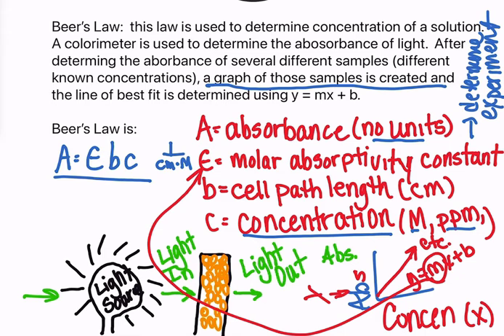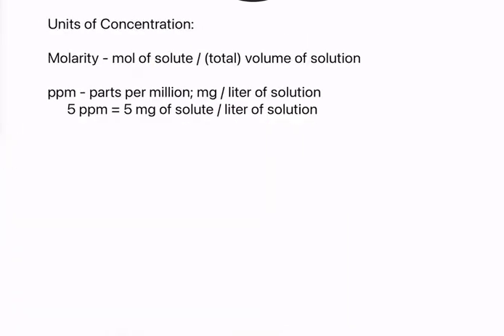And so remember, the more concentrated the solution, the less light that comes out. The less concentrated or more dilute the solution, the more light comes out.